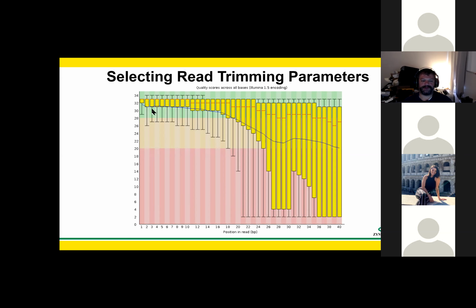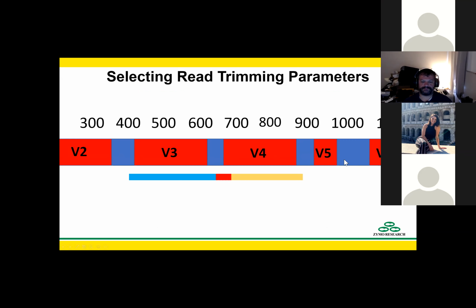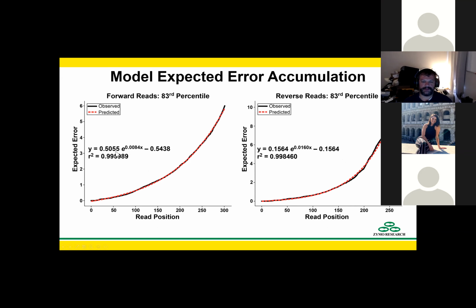The problem is that typically quality scores are plotted this way. And if we look at the quality scores plotted this way, I can't tell you at what point I have one expected error here, because that actually becomes a matter of looking at this curve and trying to calculate the area under the curve for the error probability. And that is something that people don't do intuitively at all, because that's basically doing a ton of mental calculus on this thing. So it becomes a little bit easier to understand when you plot it out this way.